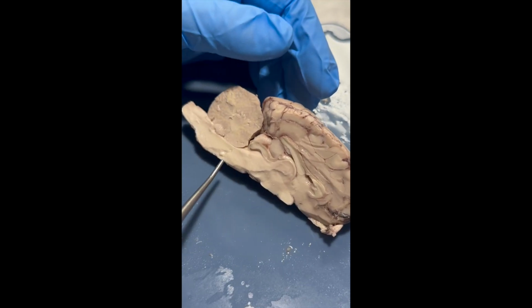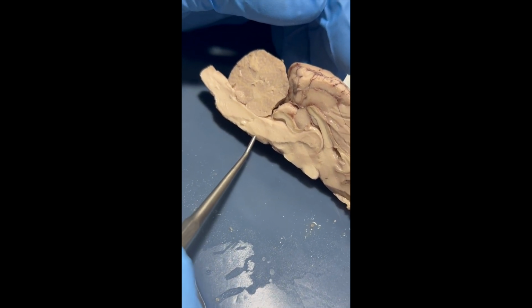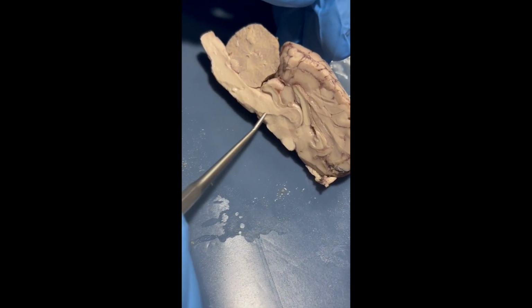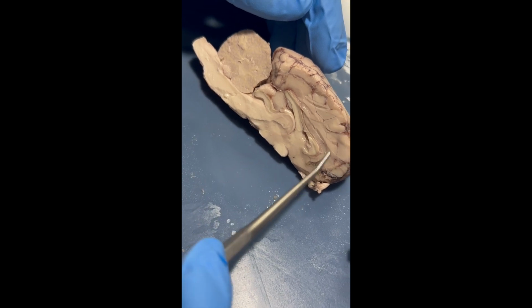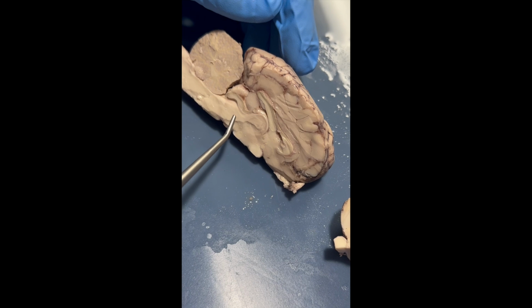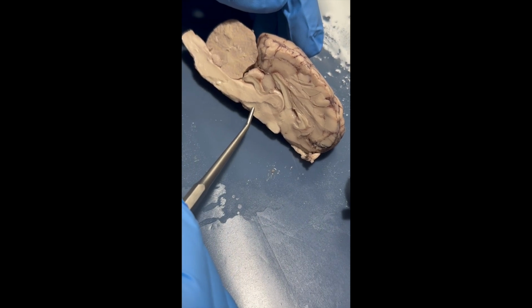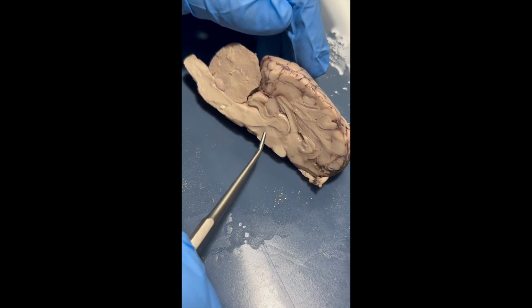Down here at the brainstem, we can talk about how it is divided. Starting with the medulla oblongata here. It is responsible for many involuntary processes like heartbeat, breathing, vomiting, swallowing, things like that. Moving up the brainstem, here's the pons. It also helps control breathing, as well as connects certain movement cortexes within the cerebrum with the cerebellum. The cerebellum is this structure right here. And then the midbrain, which is right above the pons, coordinates movements of the head, eyes, and trunk to visual and auditory stimuli. This is like if you hear a loud noise and orient your body and your eyes towards it. The midbrain is responsible for that movement.